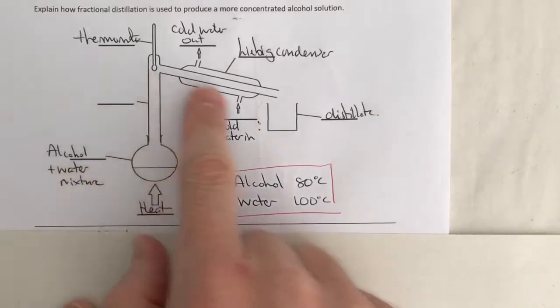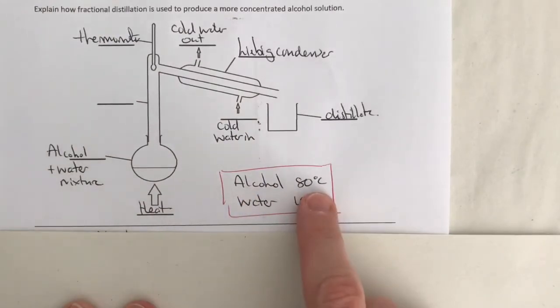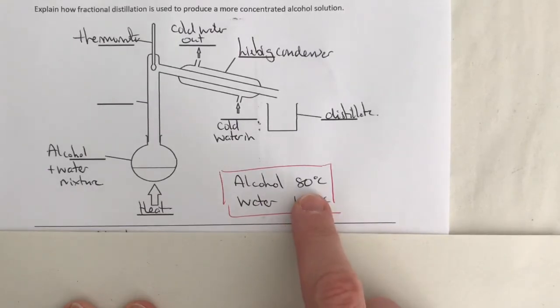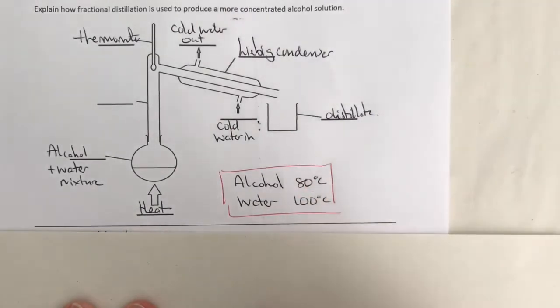This fractional distillation process uses the fact that alcohol has a boiling point of around 80 degrees, whilst water has a boiling point of 100 degrees. So the fact this is lower means this will boil off first, and we can then collect that, condense it, and we've got the pure alcohol leaving the water behind. That's how this works, okay?